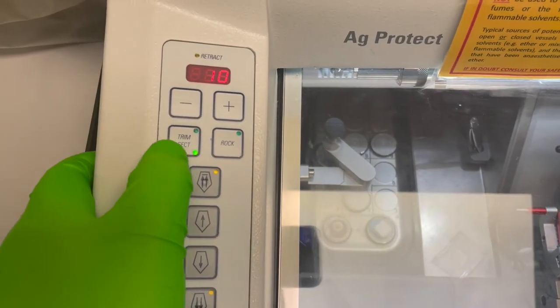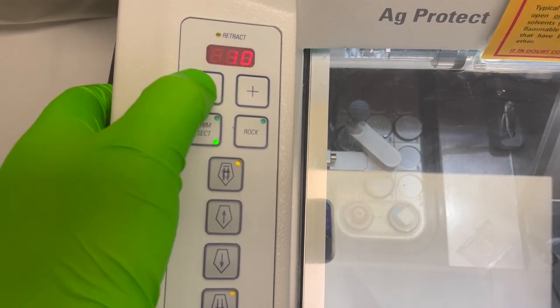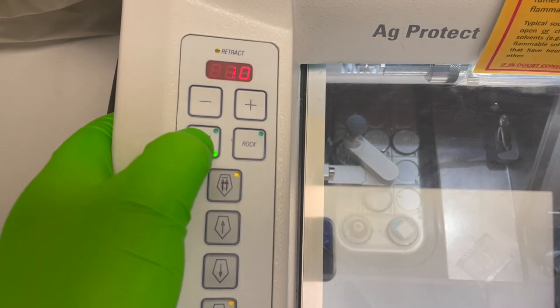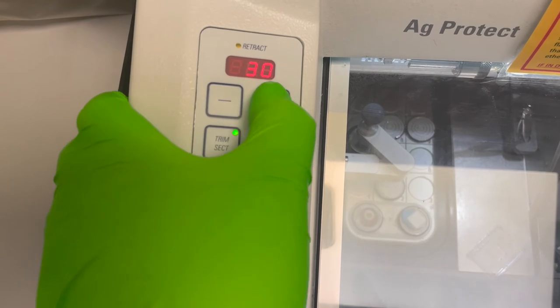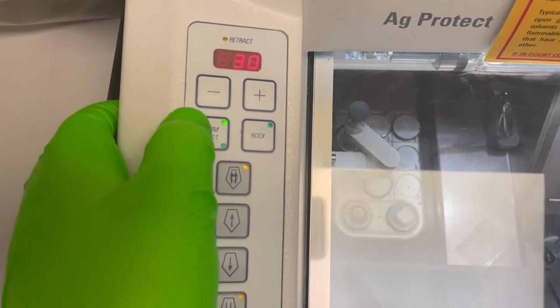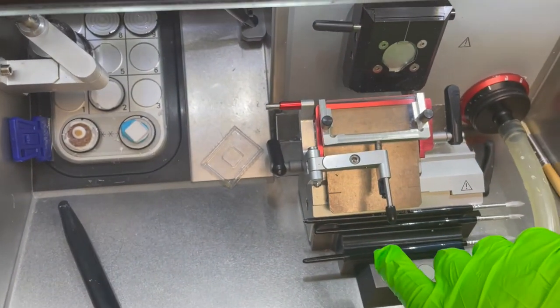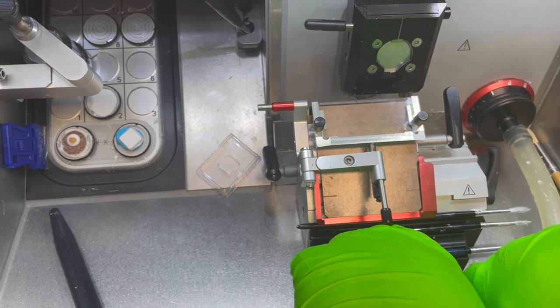You've got trimming and sectioning — you can toggle between the two and change the thickness in microns. Routinely you can do 10 microns for sectioning and 30 microns for trimming, and you can change those values as well. You may want to section thicker or thinner — that's up to you. The anti-roll plate covers a range of 5 to 50 microns. We have one anti-roll plate for 50 microns and above, and one for 5 microns and below.